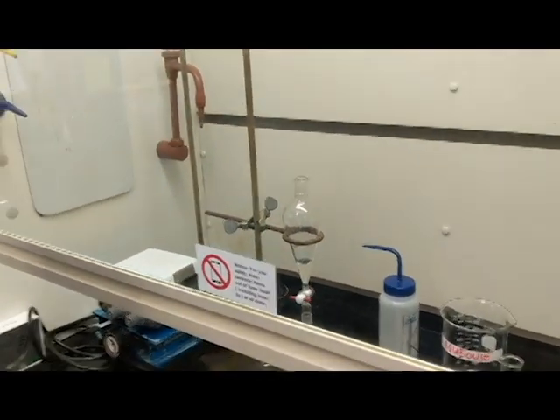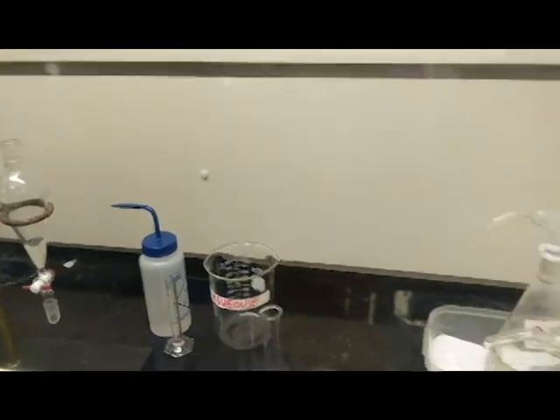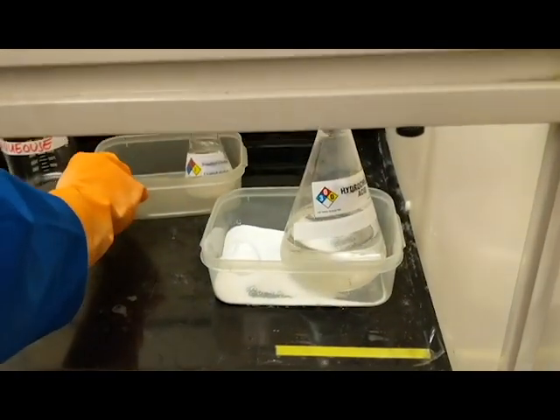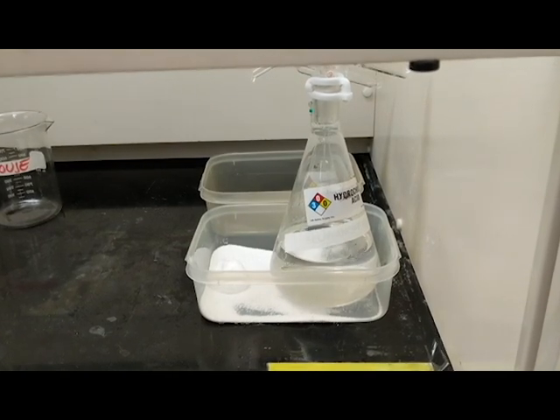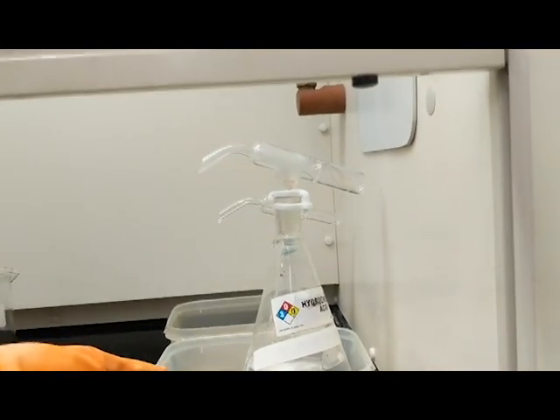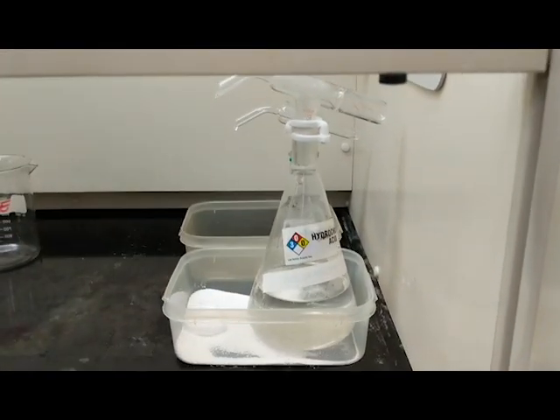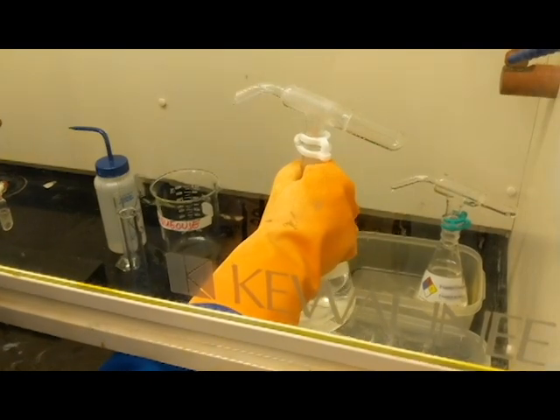Your procedure next says to add 25 mLs of 12 molar hydrochloric acid. Notice that the hydrochloric acid has a white solid on the bottom of the secondary container. That's sodium bicarbonate, and it's used as a neutralizing agent. Should any of the droplets fall into the secondary container, they will be neutralized. You'll hear a hissing sound, and that is just fine for the neutralization of any concentrated acid that should fall in here.